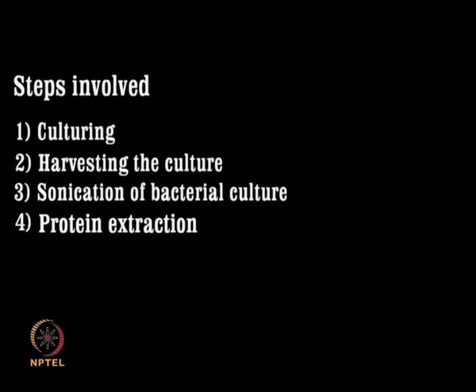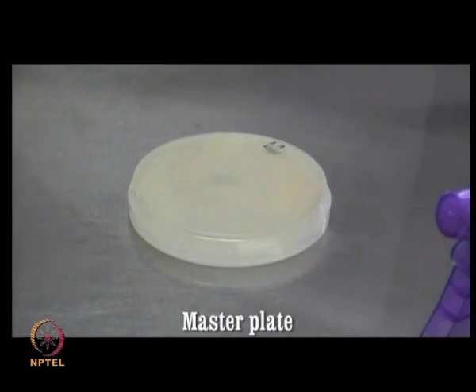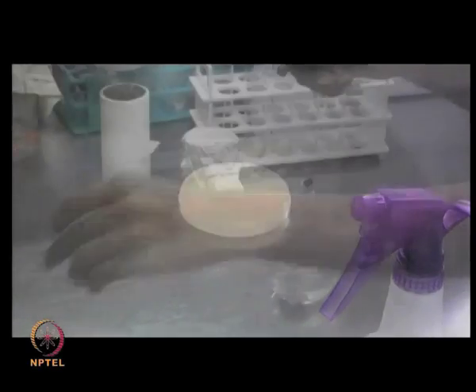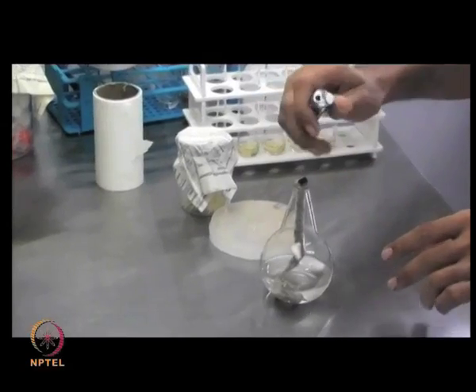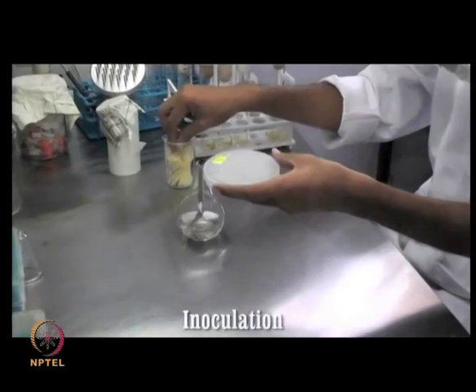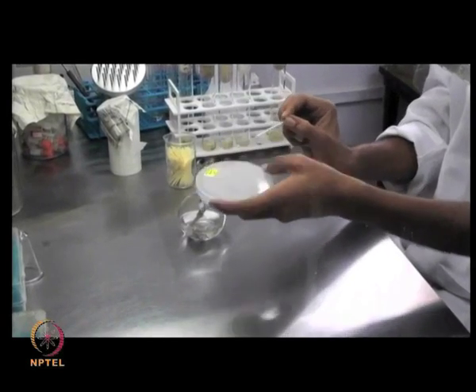This process involves culturing of bacteria, harvesting and sonication of the obtained culture, followed by protein extraction. Bacterial culturing. Clean the laminar workspace thoroughly with ethanol and keep the master plate having the bacterial culture ready. Light the spirit lamp or Bunsen burner to maintain sterile and aseptic conditions throughout the process.